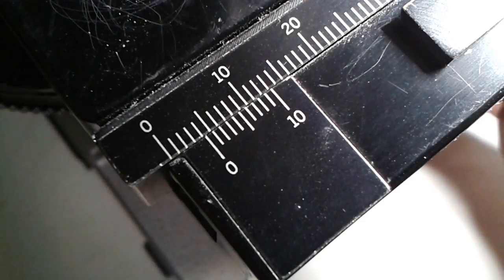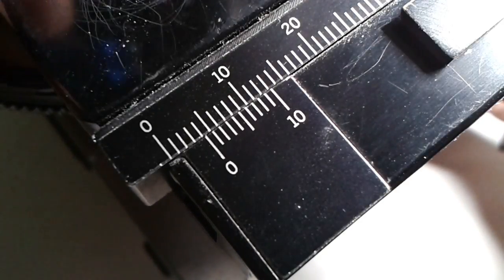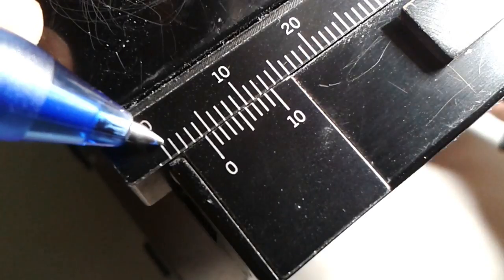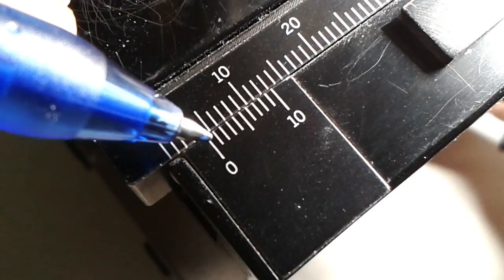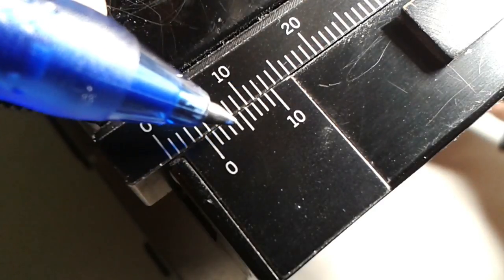And that is very convenient because especially at higher magnifications if you write down the coordinates with a precision up to a tenth of a millimeter, then you can actually easily find the specimen again.